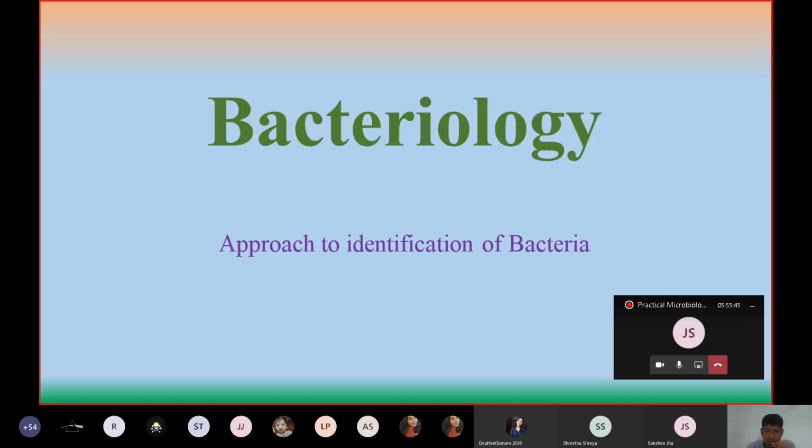Then again, identification of bacteria will not be complete. So later on, we'll be talking individually on the different bacteria that you are going to practice for. So I would like to continue the class with how we approach the identification of the bacteria.